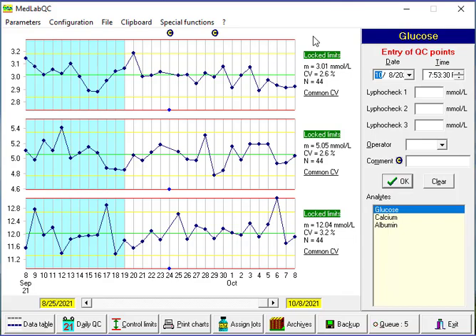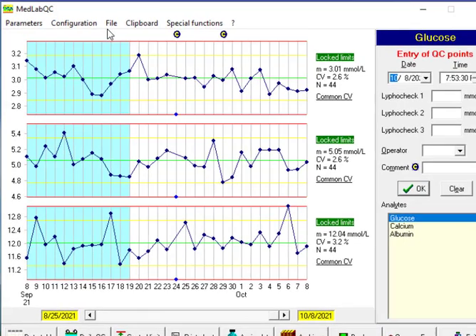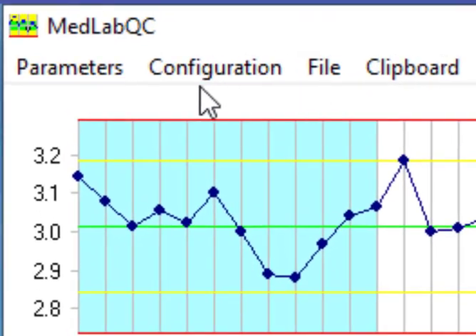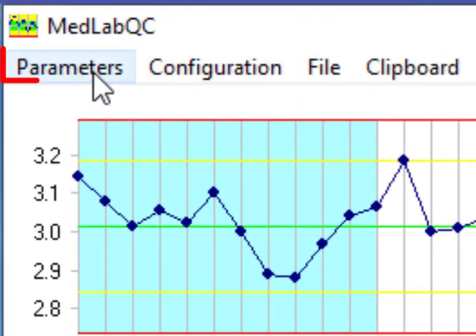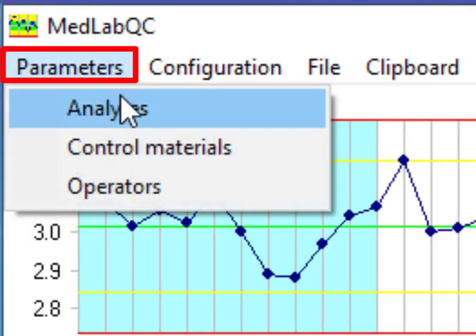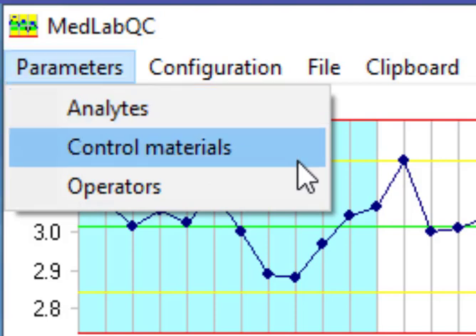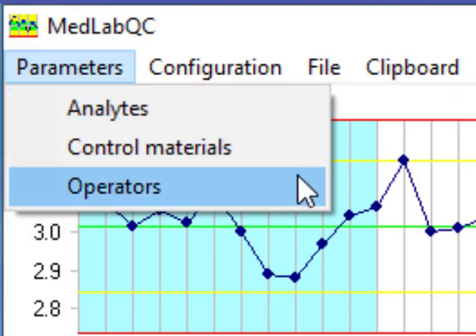There are different parts on the main screen of software. For example, on the top we have parameters which is used to define analyte, define a control material, and of course to specify name to each operator that is using this software.